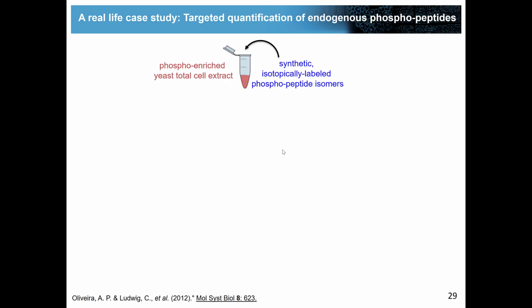Okay, and on this last slide, I just would like to show you that all this work that we invested into ordering the synthetic phosphopeptides, measuring them first individually, and then mixed and looking at all these chromatograms is really worth the effort, because we used exactly what I just showed you, what we learned, to quantify phosphopeptides in real samples.